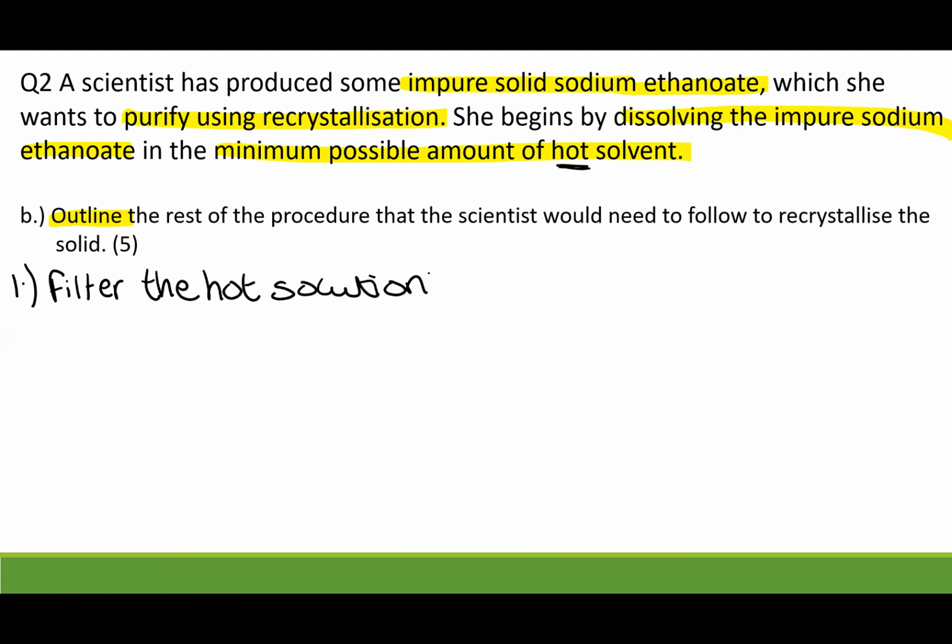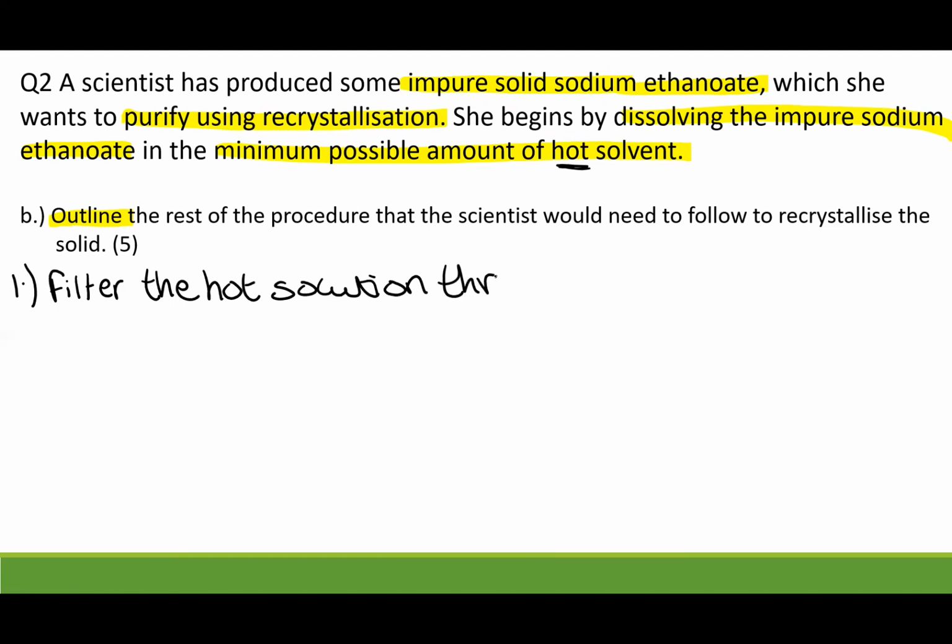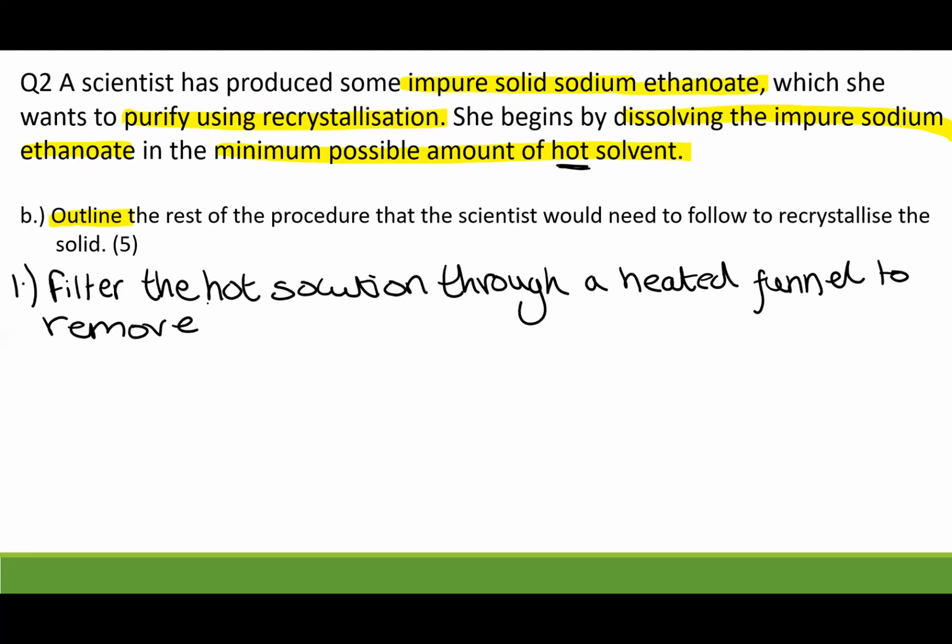So we're going to filter the hot solution through a heated funnel, because we want to keep the temperature high, and this is to remove any insoluble impurities. That will get you your first mark.